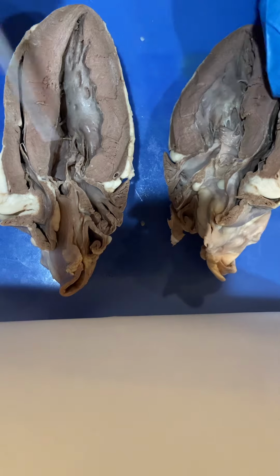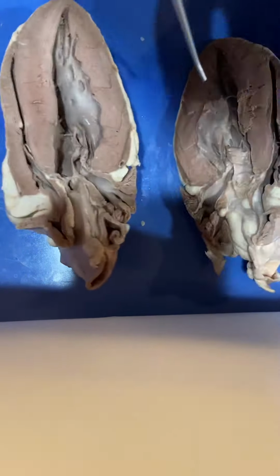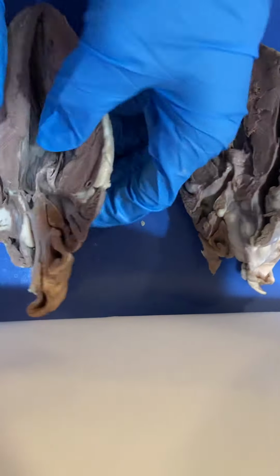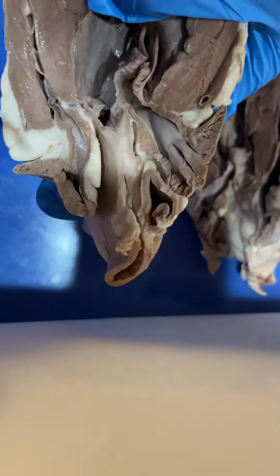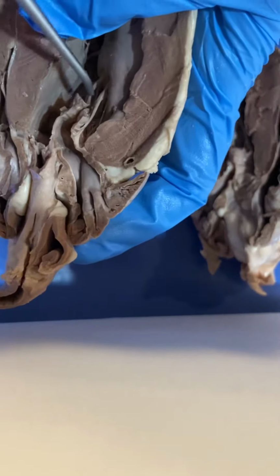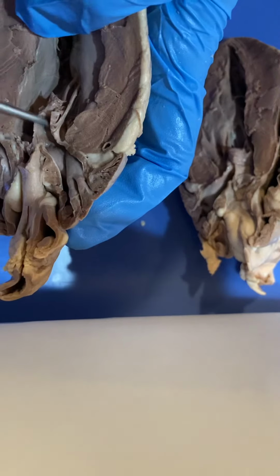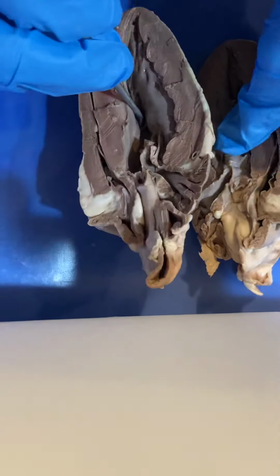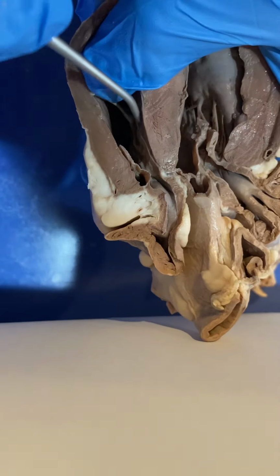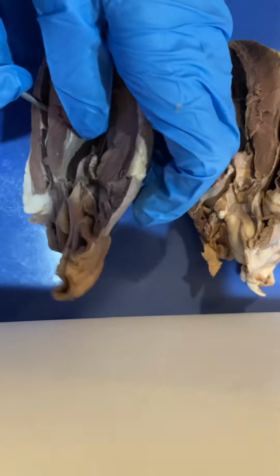Some other key features that you will notice is the apex and the base. And you'll notice the different valves. So I will have to lift this up to you, but you'll notice the valve here. Now this is going to be the bicuspid valve. You'll see that it has two cusps right here, and this is going to be the valve that enters the left atrium and the left ventricle. Now the other valve that you will see, it's a little harder, but this is going to be the tricuspid valve, and this is going to separate the right atrium and the right ventricle.